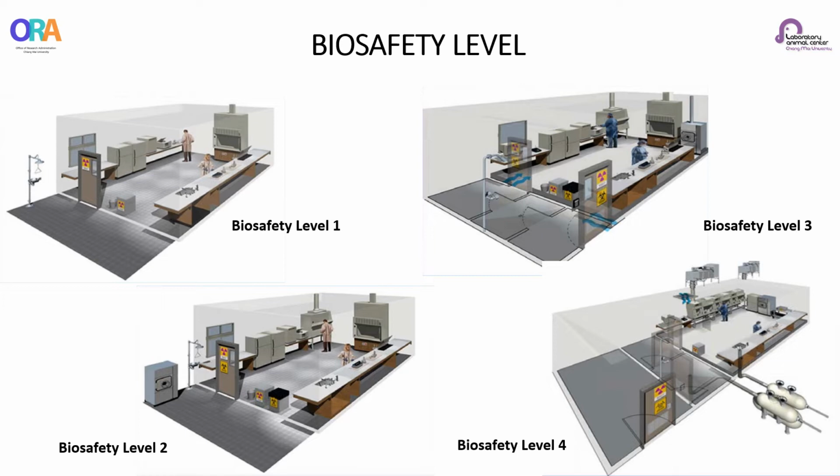The next is BSL-3 laboratory. BSL-3 laboratories are used to study indigenous or exotic biological agents with the potential for respiratory transmission and those that may cause serious and potentially lethal infection.